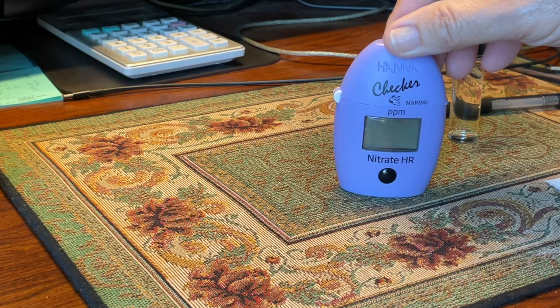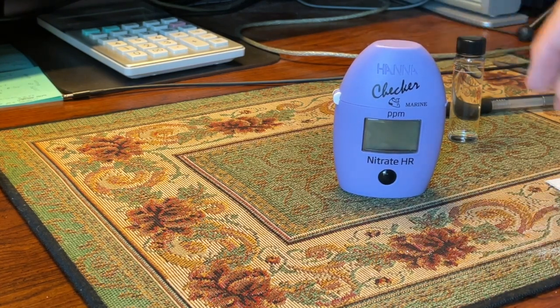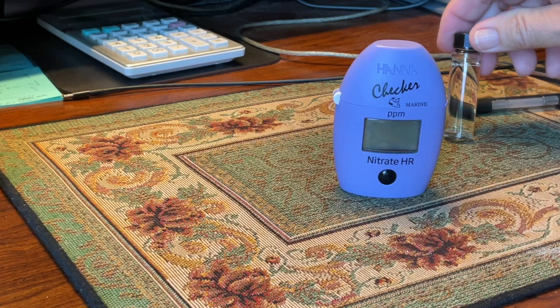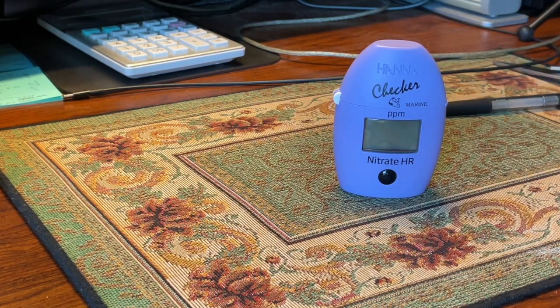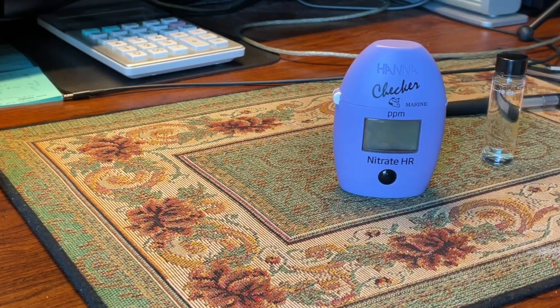Here I have a Hanna nitrate tester and I'm going to show you how to use it. One of the hobbyists bought one and wanted to know how to use it, so I filled a vial up to the 10 milliliter mark with my antique goldfish aquarium water. I've double-checked this — even though it says marine, some people are going to say it's not as accurate.